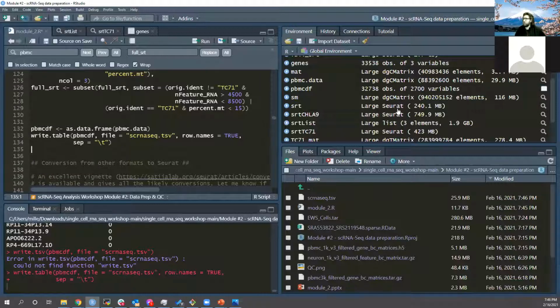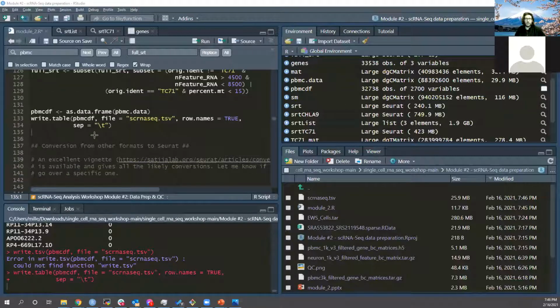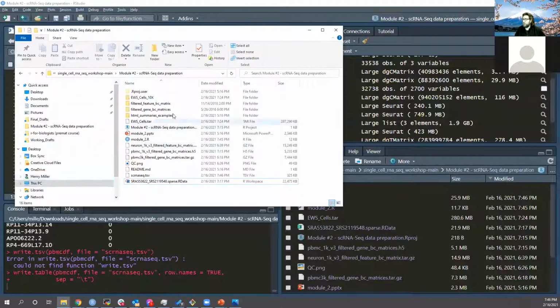All right, but going back to what we saw before, when you do encounter this in the wild, do feel free to also tell your boss or your lab mates or whoever that you really would like to see the source for this data, because you really have no idea how this was created or how the upstream processing was done.